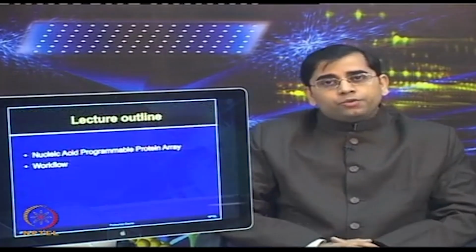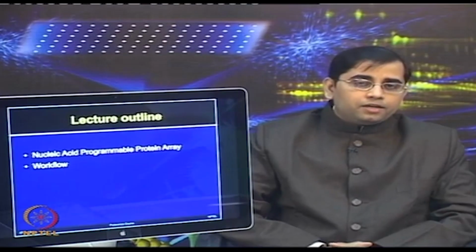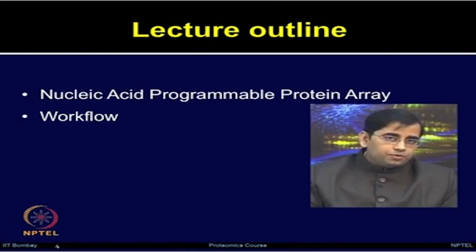So, with a little bit of overview of cell free expression based systems and the different types of protein microarray platforms which we have discussed, today we will focus more on how to make protein microarrays by using the nucleic acid programmable protein array approach.